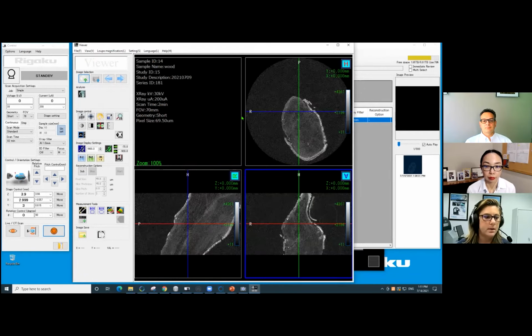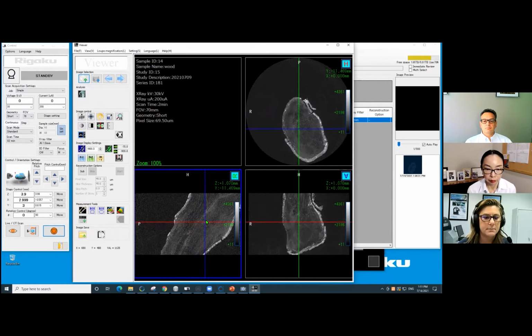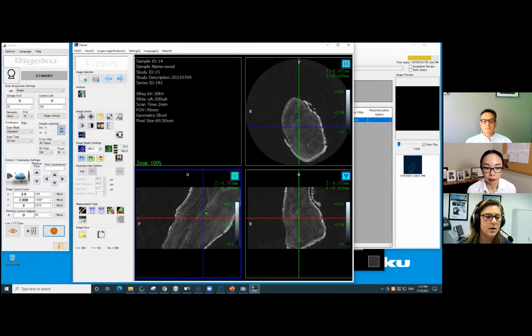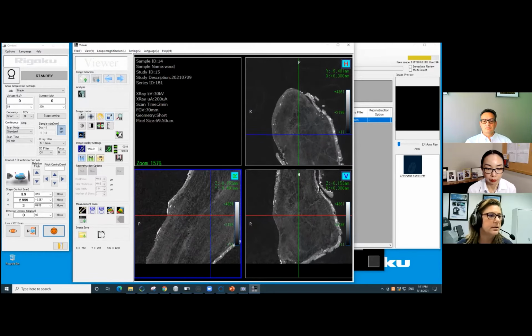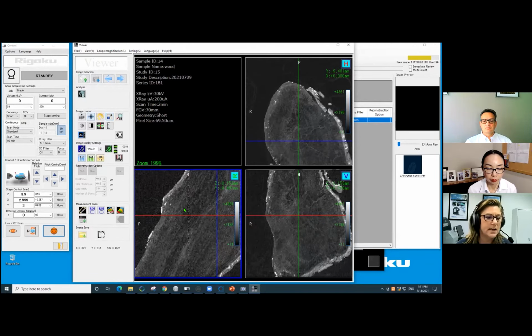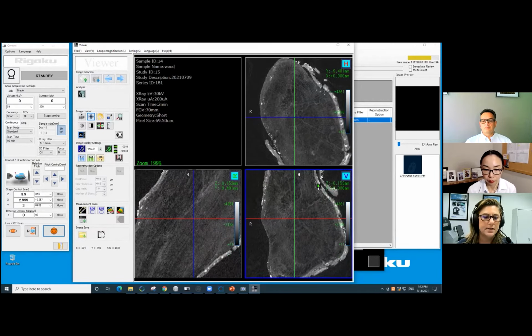Okay. All right. So here are 3 2D cross sections of this material. And some of the things that we see immediately are that, if we zoom in a little bit here, we can definitely see the bark area. We can see some striations inside, that would be the rings in this case. We see some cracks in this case.